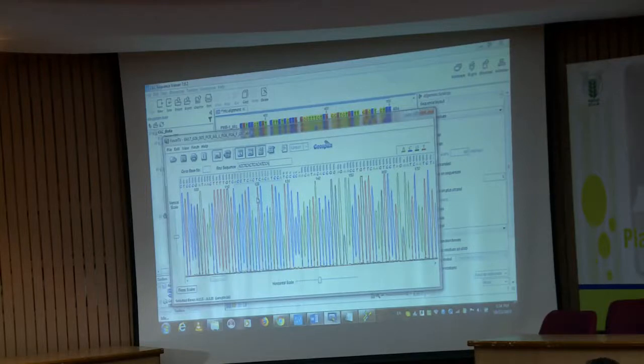Correct. Now, what is the next base to the selected sequence? It is T only, right. Although the quality is not very good, because you can see there may be some resolution issue over here.